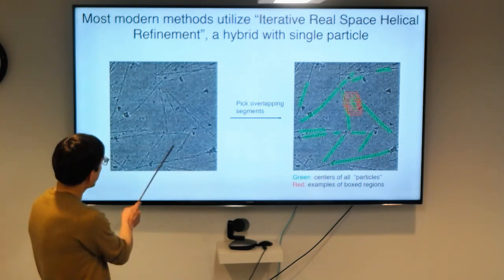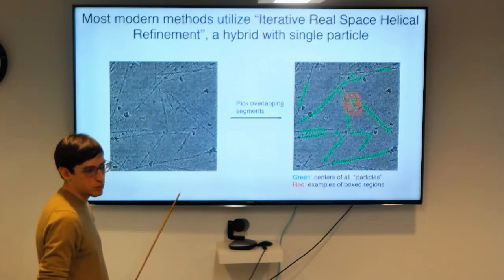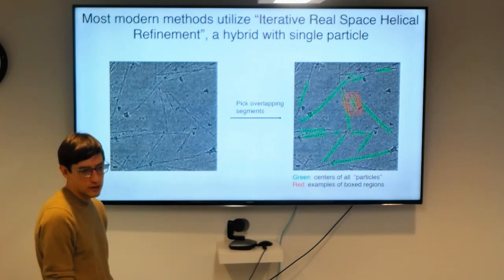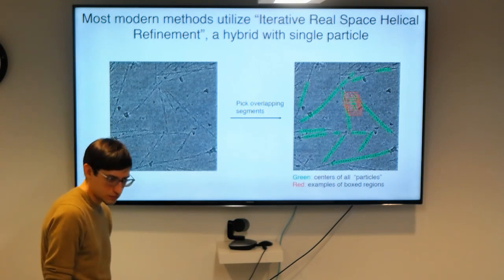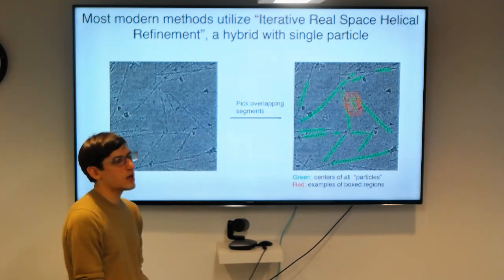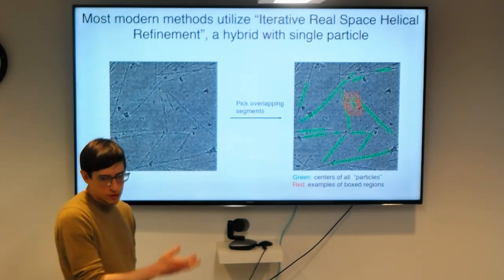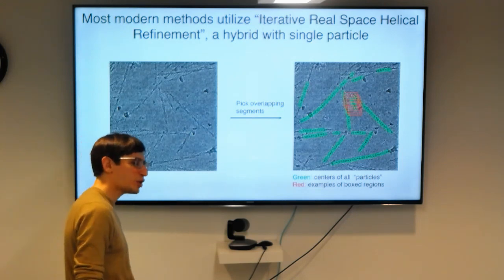Because, for instance, actin doesn't have an integer number of subunits per 360 degrees of helix, which has historically been useful in indexing helical diffraction patterns. So how many biological samples do you have an integer number of whatever per 360? Is it common? It's pretty uncommon. But it was historically useful for indexing. Even if you're slightly off, it'll still work out. But this one is pretty off.